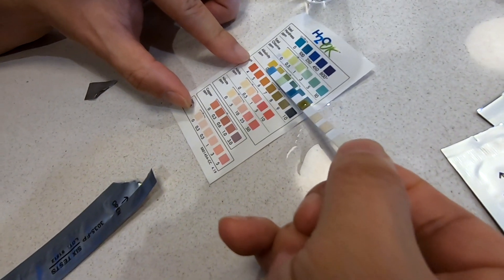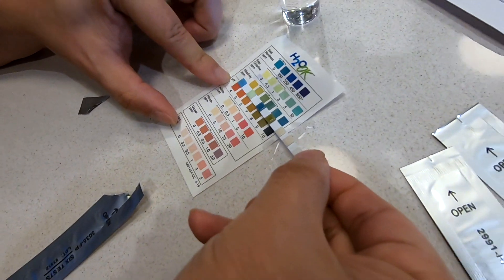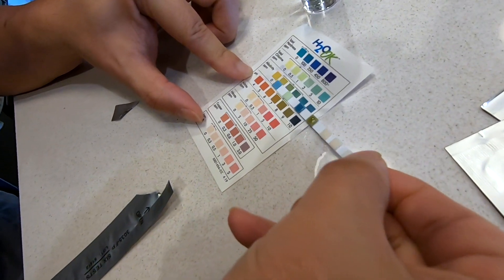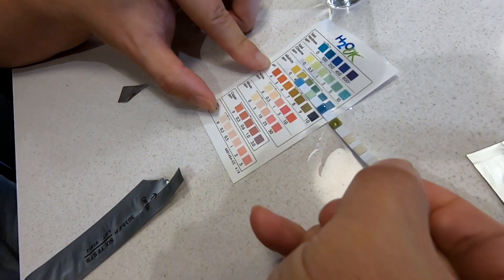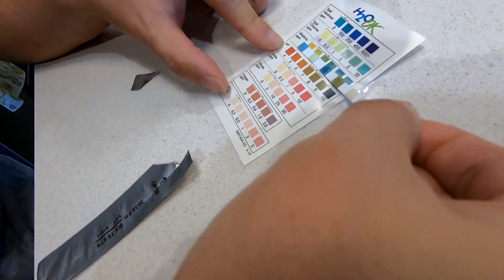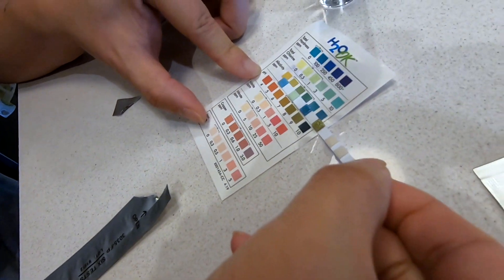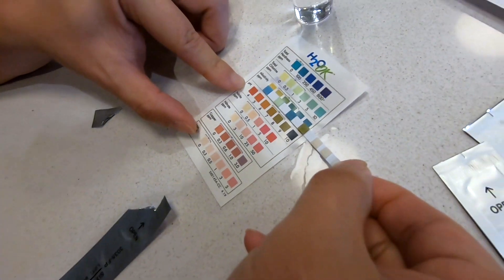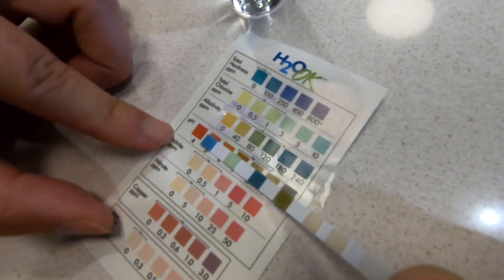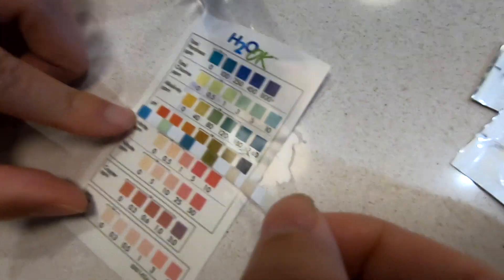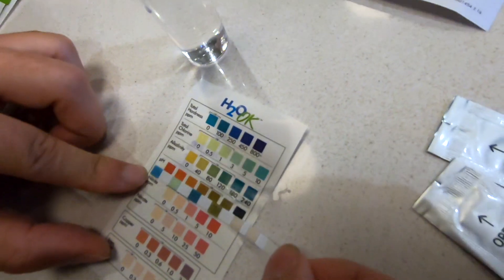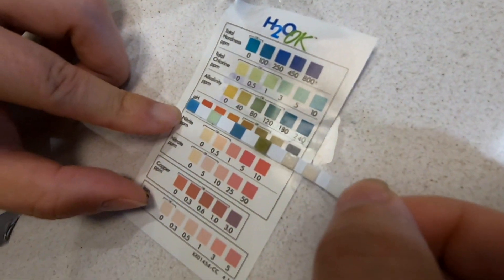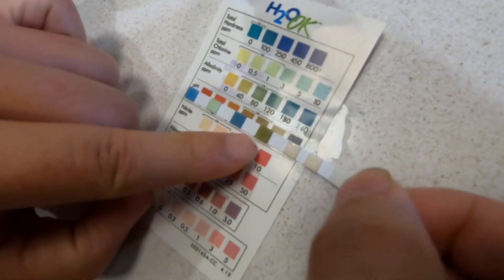And alkalinity, we are very alkaline which is supposed to be good, but I guess we're supposed to be at okay level. We are slightly higher, right about here. Not that bad. So everything so far is slightly elevated. And then the pH we are here, slightly high too, somewhere around here.